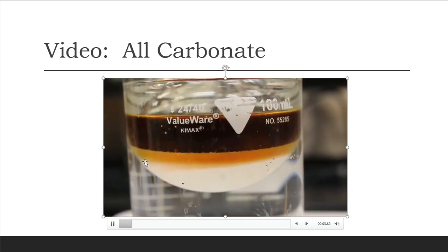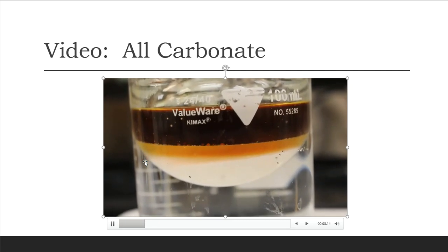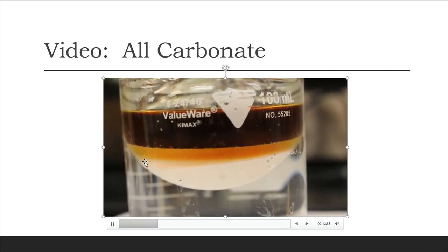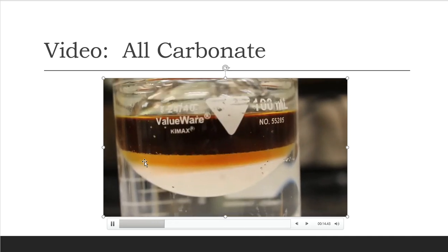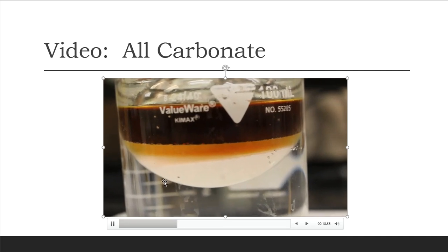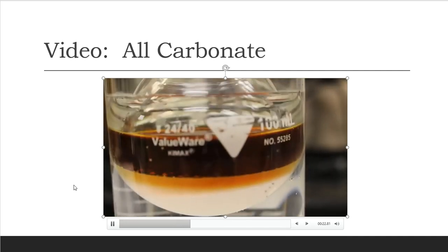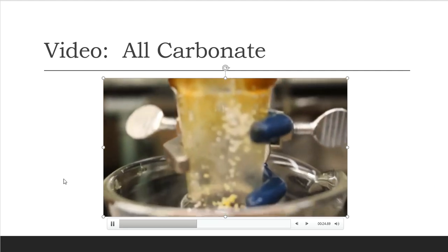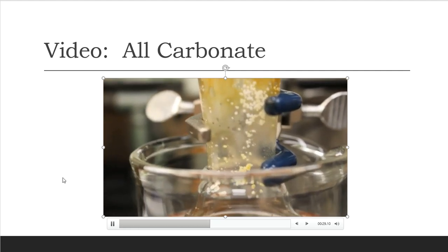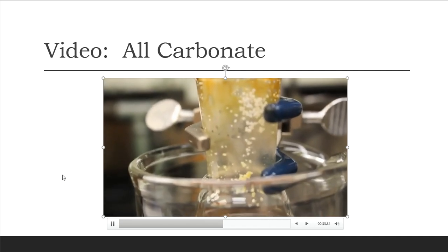All right, so here is the final addition of the potassium carbonate. I want you to take a look at the boiling flask and tell me what you see. All right? I'm not going to tell you what I see. That's up to you. That's your observations to make, not mine. But folks, this is the end of the potassium carbonate. So I've got a little bit of potassium carbonate up here at the very top of the neck, as you can see. I'm not going to worry with getting all of that out of there. This is going to be okay.